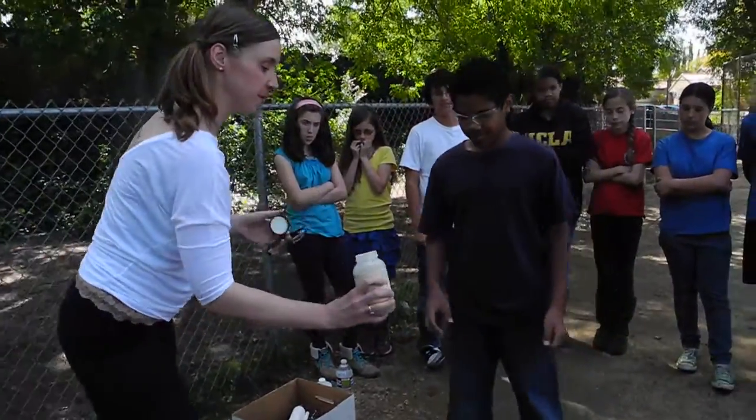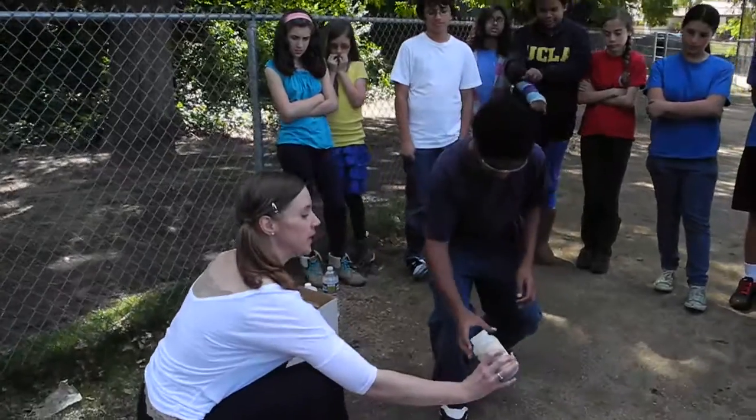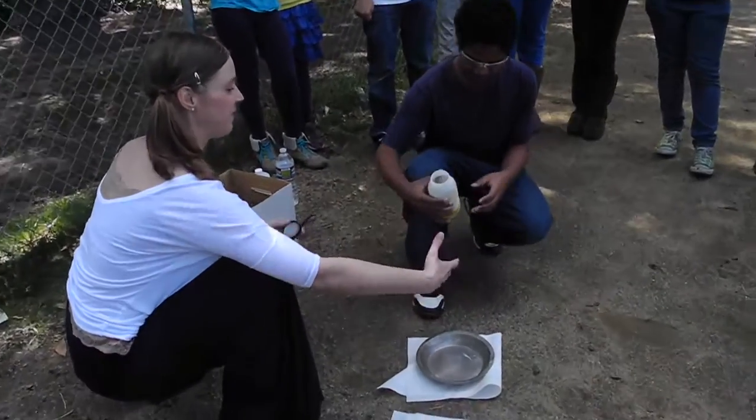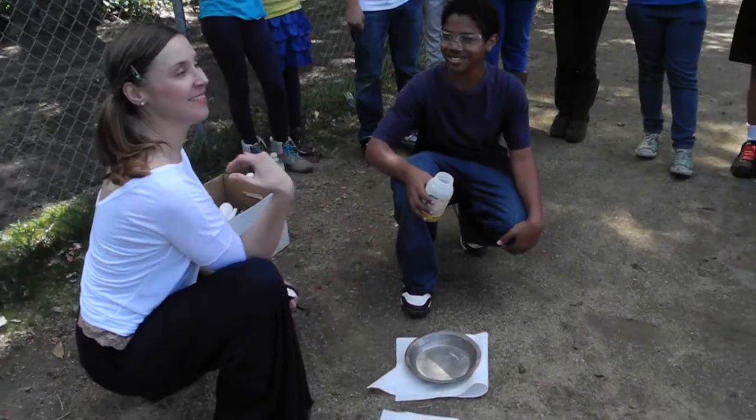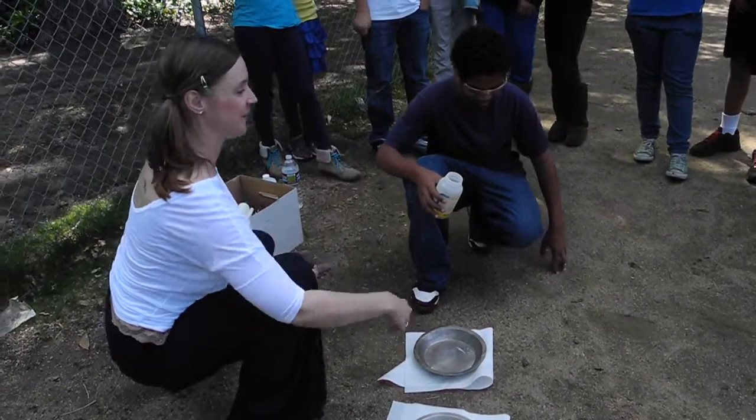All right, Malik's going to be our Mr. Wizard. Malik, do me a favor. It's a powdery substance, yeah, and we agreed it's kind of fine. Somebody the other day said, oh, blow on it. Is that a good plan? No, because that stuff could go flying, right? And that's not necessarily a great idea.